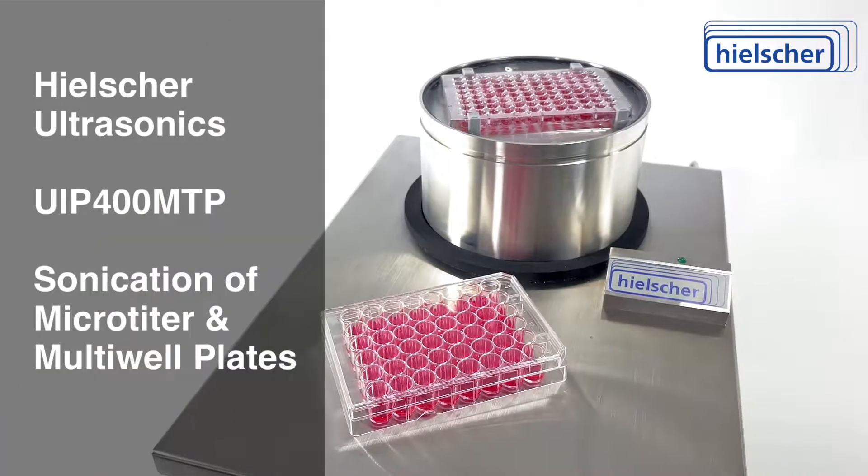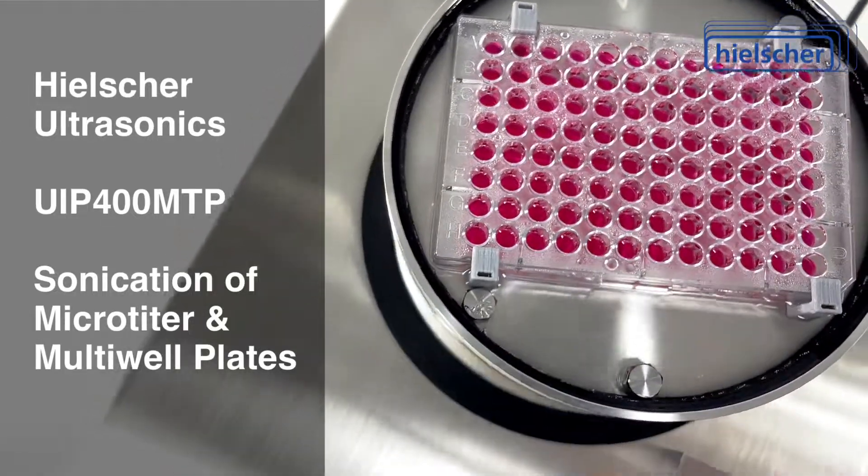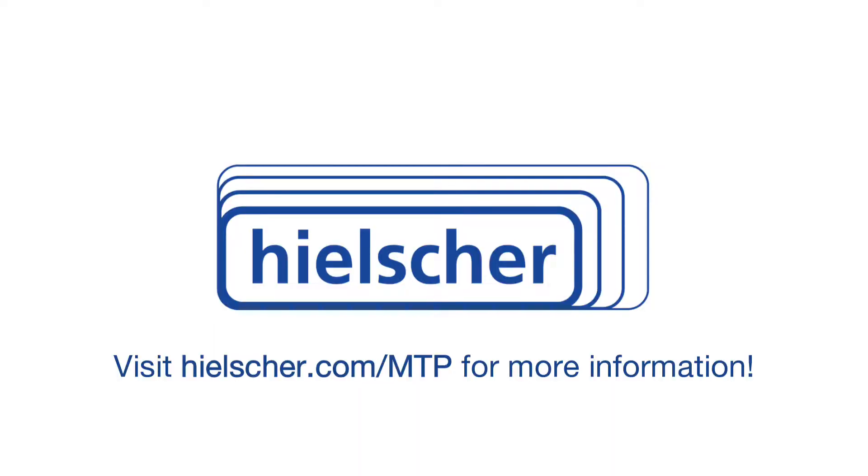We look forward to answering your questions and making your ultrasonication a success. Visit Hielscher.com/MTP today and contact us for more information.